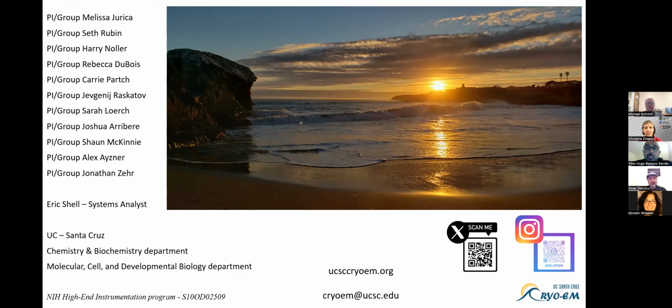So we increased the number of particles because once we do the 2D classification, we can actually see clearly where the N terminal is. Even looking at the side view, you're supposed to be seeing the pinwheels sticking around, but it's hard to see. We start seeing them once we go further in the 3D data processing, with a lot of CTF refinement after getting your perfect alignments.